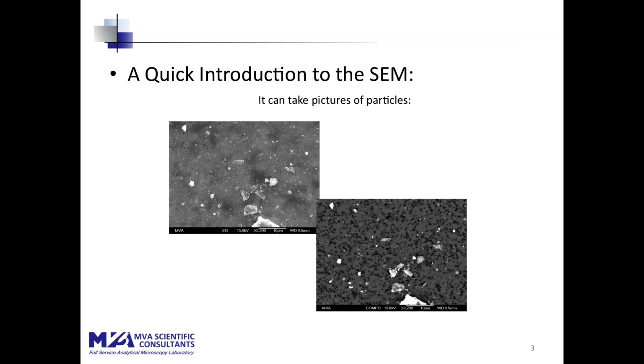So the two different imaging modes highlight two different things. The advantage of the backscatter electron mode is that it highlights the Z contrast, or the atomic number of the particulate, so that you can see that this particulate, which is principally aluminosilicates, shows up bright against the background of a polycarbonate filter, which is principally carbon and oxygen.